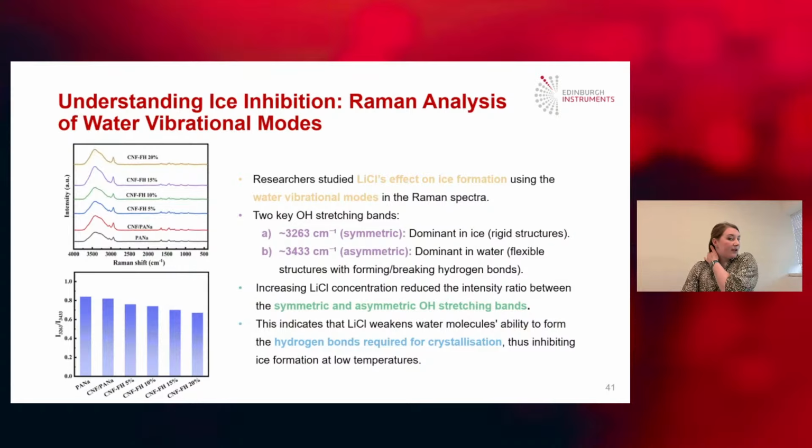They then wanted to understand the process that was occurring when this lithium chloride was introduced. To do that, they wanted to look at the water vibrational modes, in particular two key OH stretching bands. The first, the symmetric stretch, was at 3263. This is dominant in rigid structures like ice. The second was the asymmetric stretch at 3433, which is dominant in water or more flexible structures due to forming and breaking of hydrogen bonds.